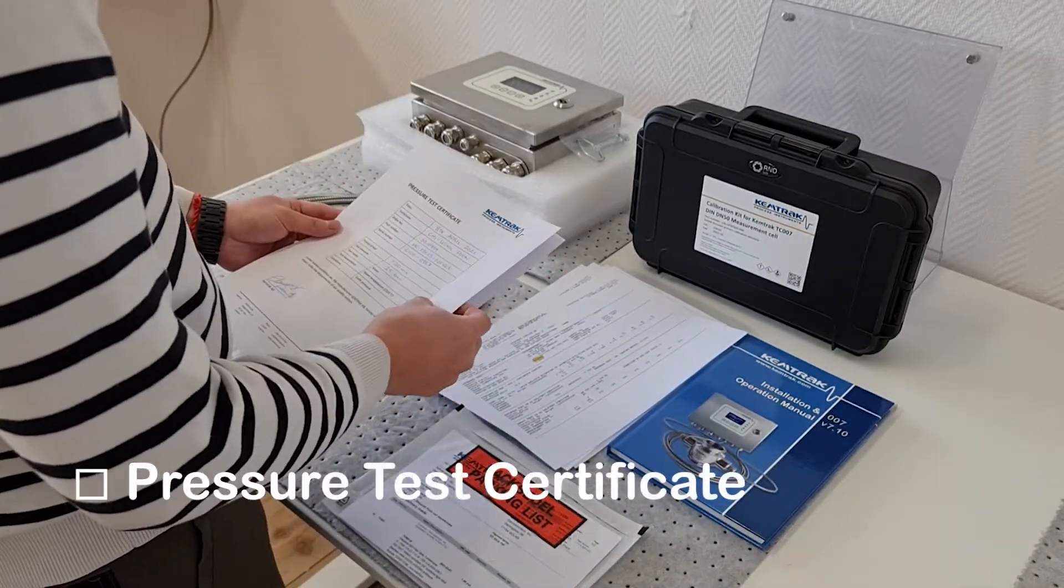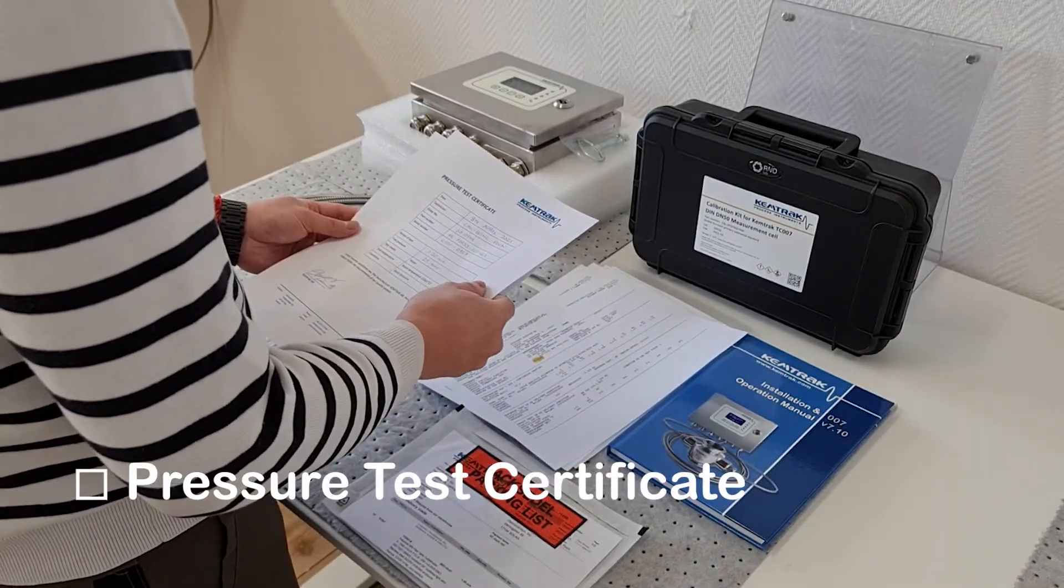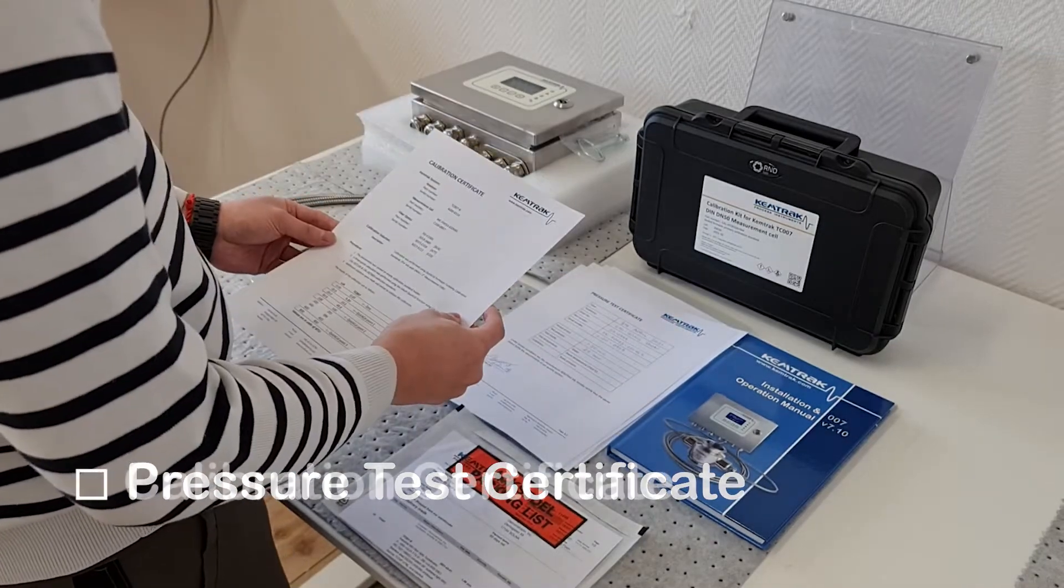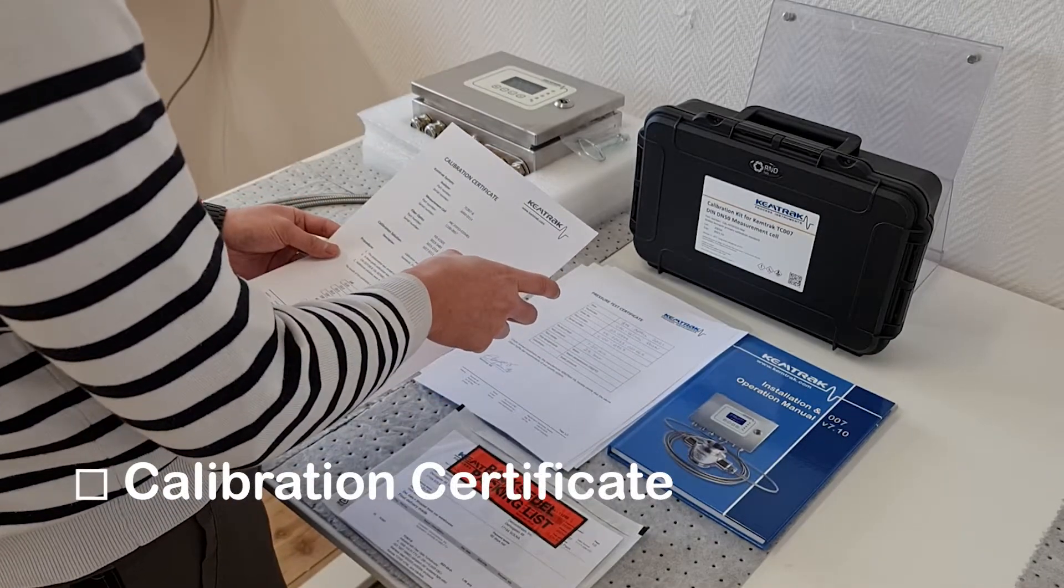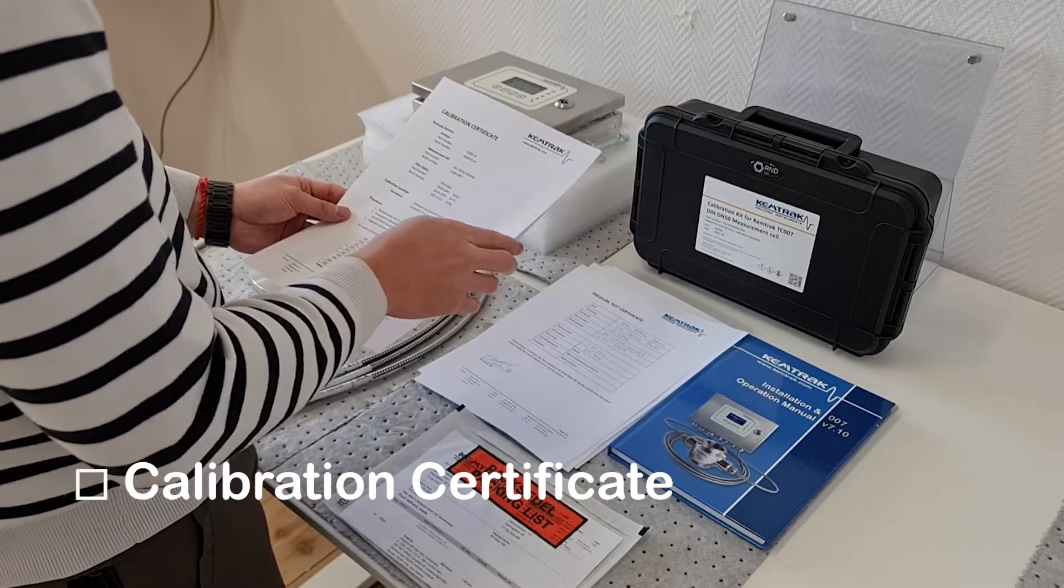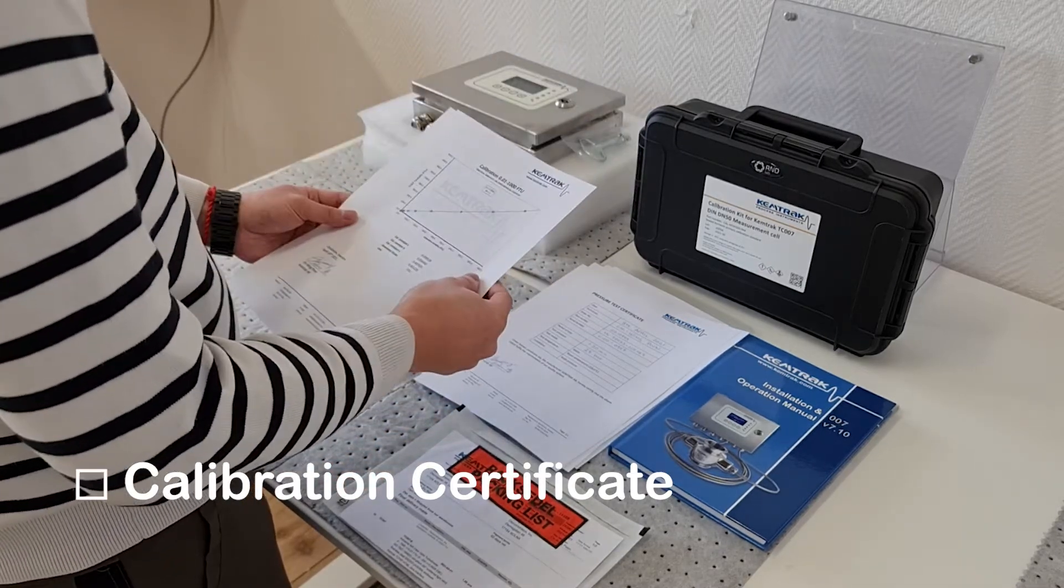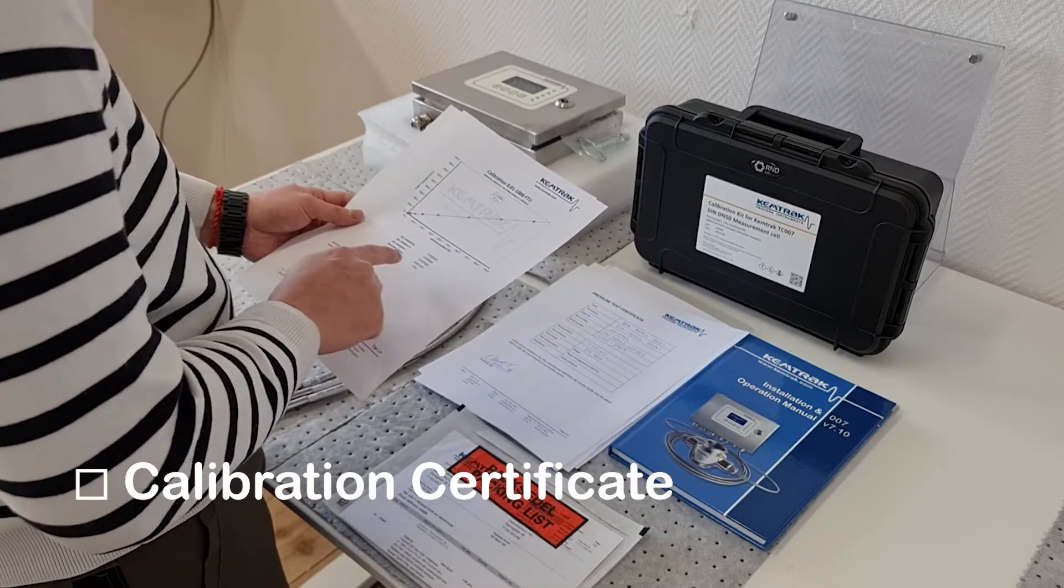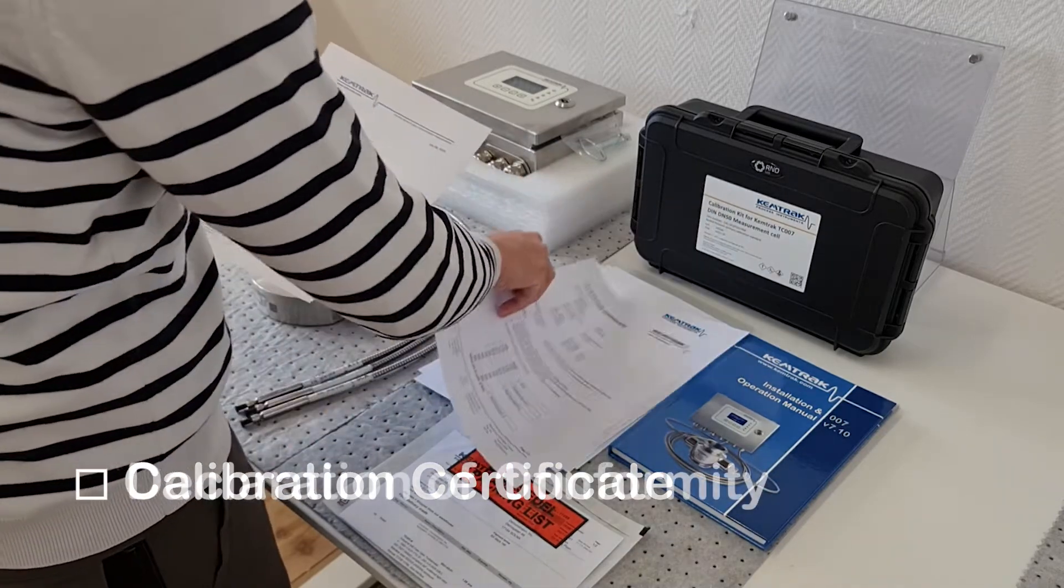The third document is a pressure test certificate. The Chemtrak TC007 turbidity meter comes complete with a factory calibration which is documented in the calibration certificate, and a declaration of conformity.